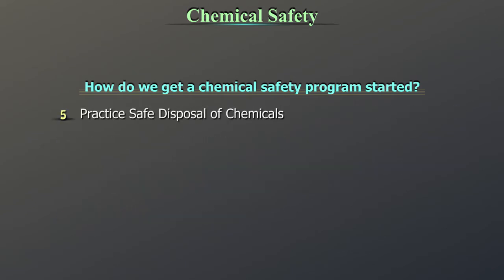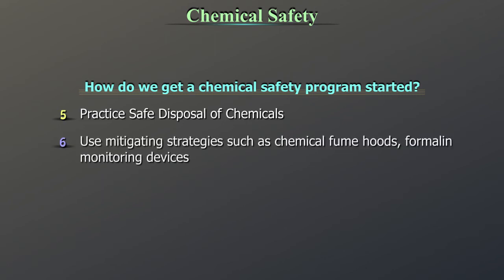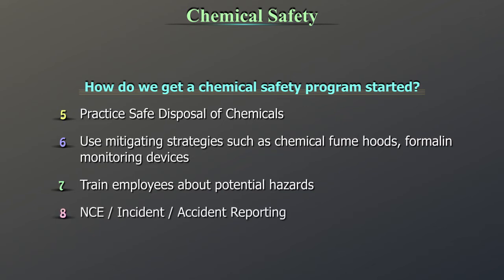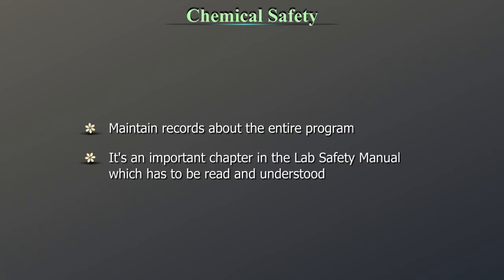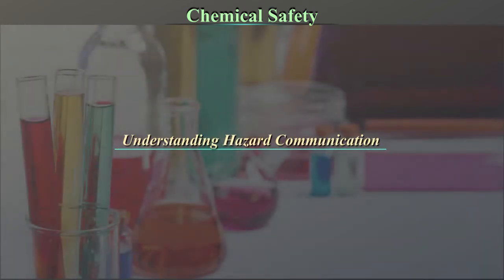Steps 4 through 8: Practice safe storage of chemicals. Practice safe disposal of chemicals. Use mitigating strategies such as chemical fume hoods and formalin monitoring devices. Train employees about potential hazards. NCE or incident/accident reporting. Maintain records about the entire program.